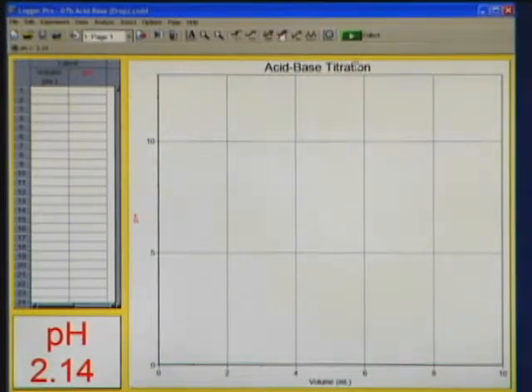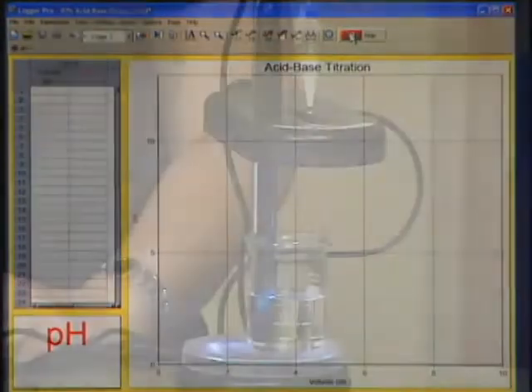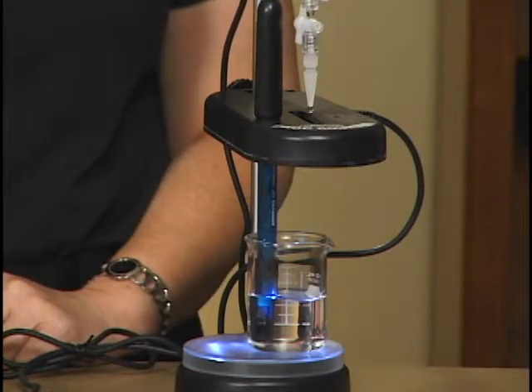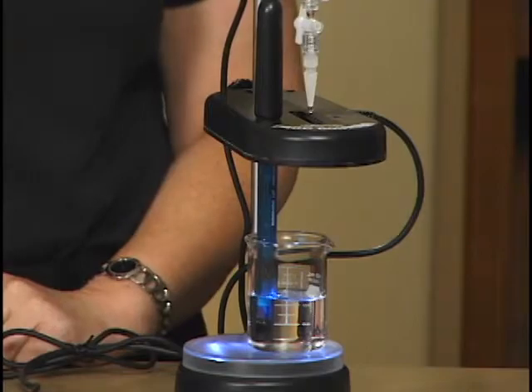I'm all ready to go. I just need to click on collect, and now it's waiting for me to start dropping the drops through the drop counter, and here they come. So here comes our data, and we just need to let this progress as our titration proceeds.